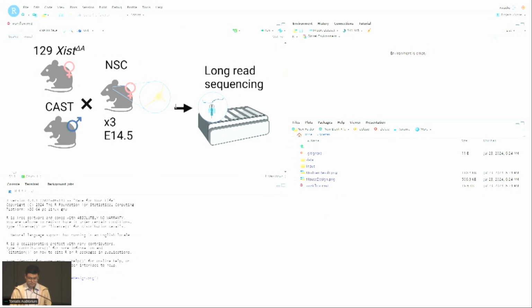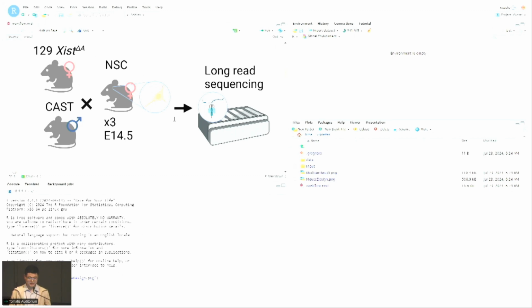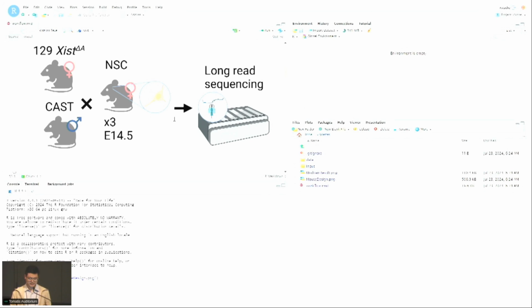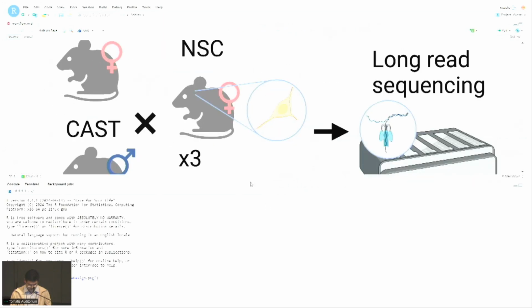What you basically do is, you get your samples and you just throw it into one of these long-read sequencers, and if you're doing the direct DNA protocol, you'll end up being able to use the Dorado software from Nanopore to just call methylation. It'll also do base calling, but overall, I'm not a wet lab scientist, but I've been told the process is very simple. It's very straightforward, and it's much simpler than all the bisulfite sequencing procedures that preceded this.